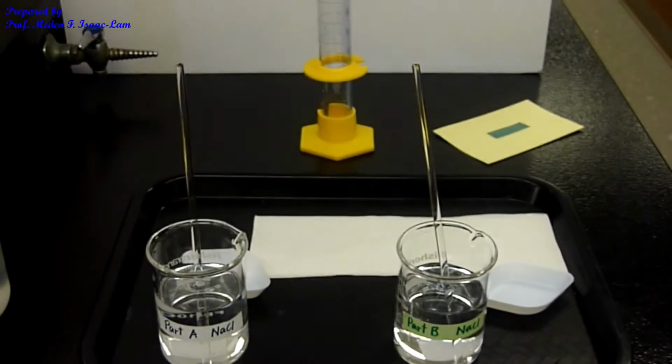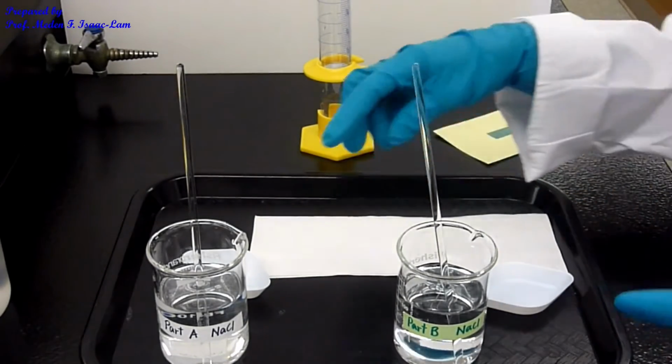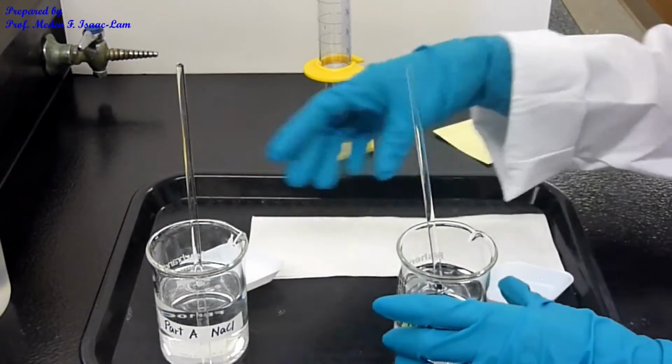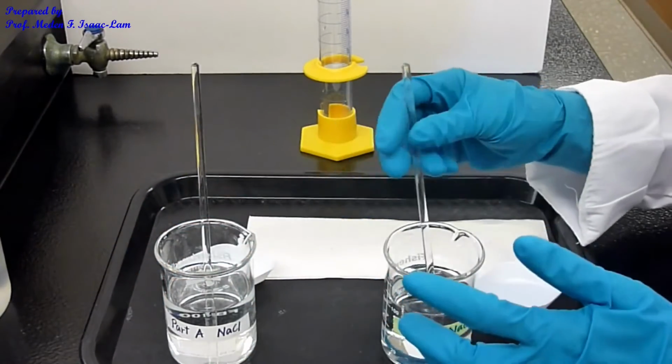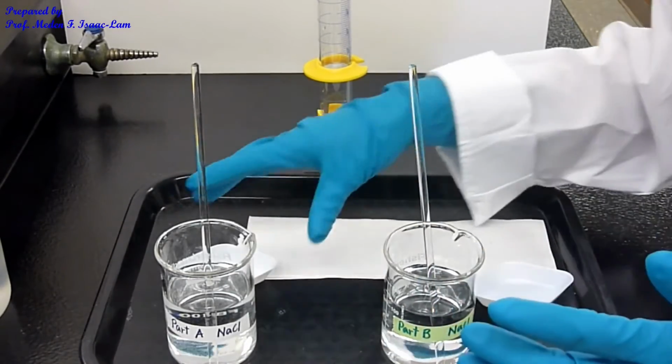So now going back to the solution in here. So this is more concentrated, this is less concentrated. You don't see a difference. Here it's hard to determine which one is, there's no way to determine, okay?